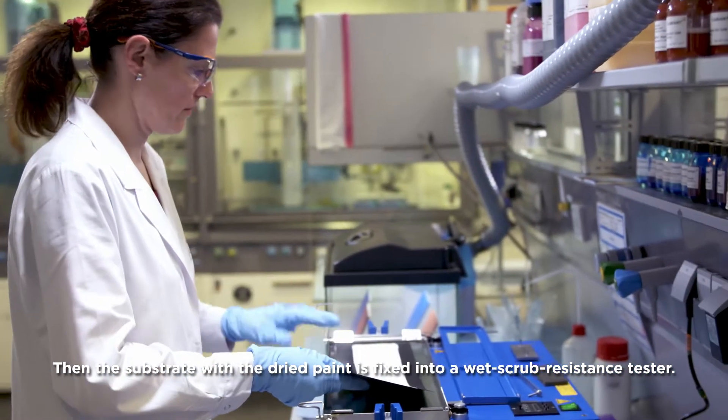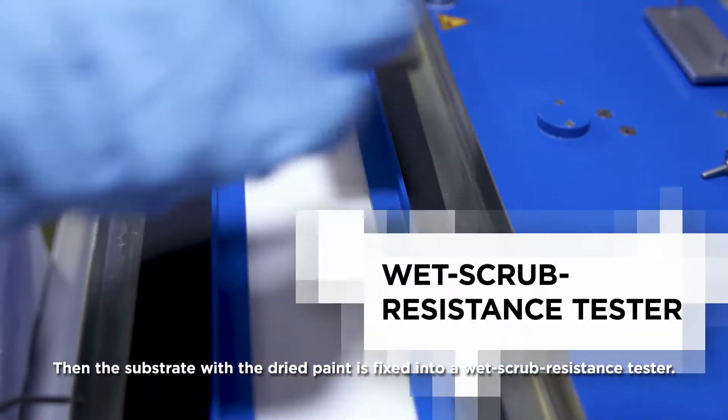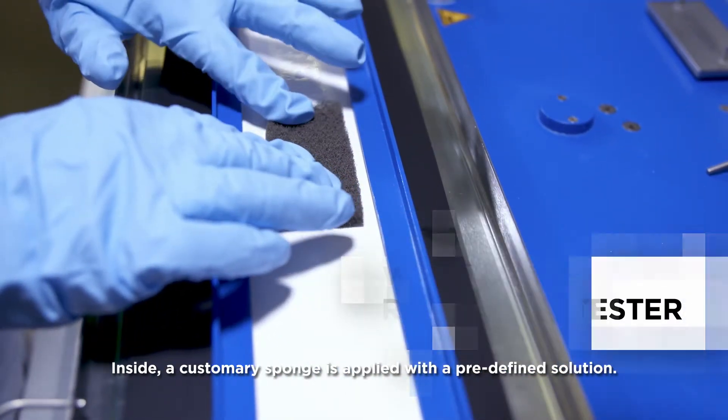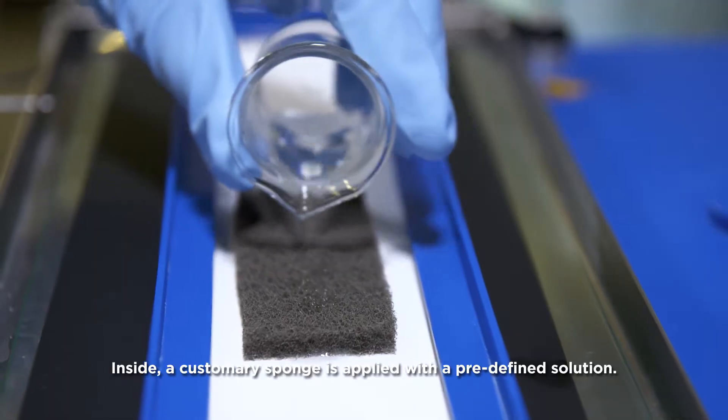Then the substrate with the dried paint is fixed into a wet scrub resistance tester. Inside, a customary sponge is applied with a predefined solution.